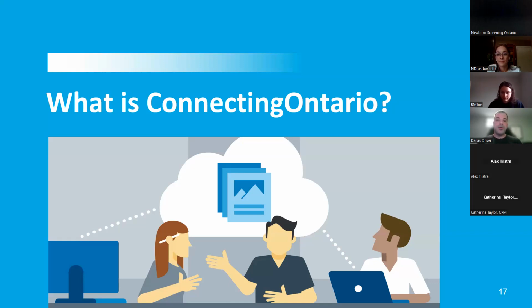So I'm going to go over just a little bit about what is Connecting Ontario specifically. What is the clinical viewer? What is the information that is available to you in addition to the OLIS lab results? We'll do a quick demo so that you can see how you would actually go about retrieving results and what you could expect to see within the clinical viewer for a patient. And then I'll just talk a little bit about onboarding requirements. So how you would go about requesting access to a clinical viewer and just a little bit about what you can expect about the process.